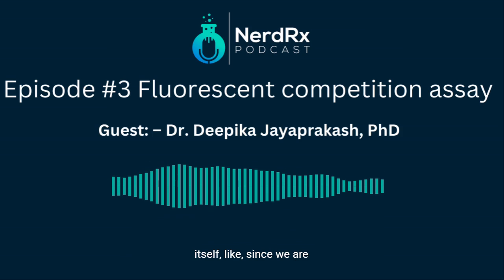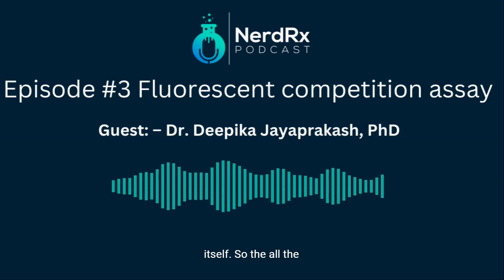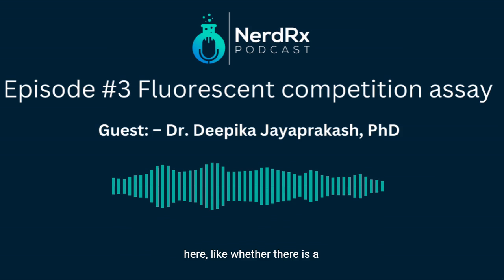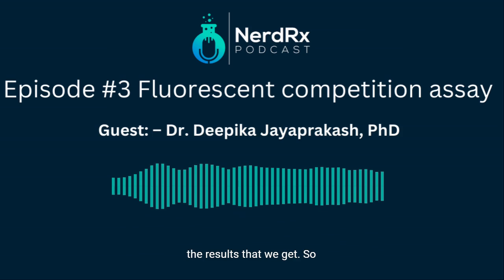Other than that, the technique itself, since we are testing the effect of the gene with CRISPR-Cas9 technology, all the disadvantages that come with CRISPR-Cas9 also apply here, like whether there is a complete gene deletion or not, or, even if it's partial, whether an aberrant protein has been generated, the effect of which is unknown. So that could hamper the results that we get.